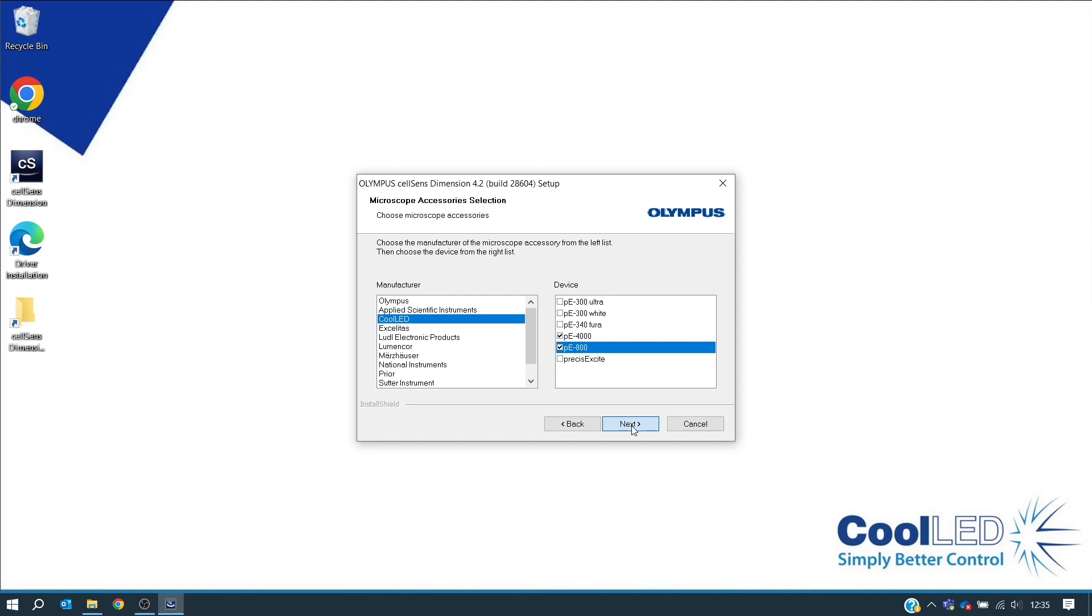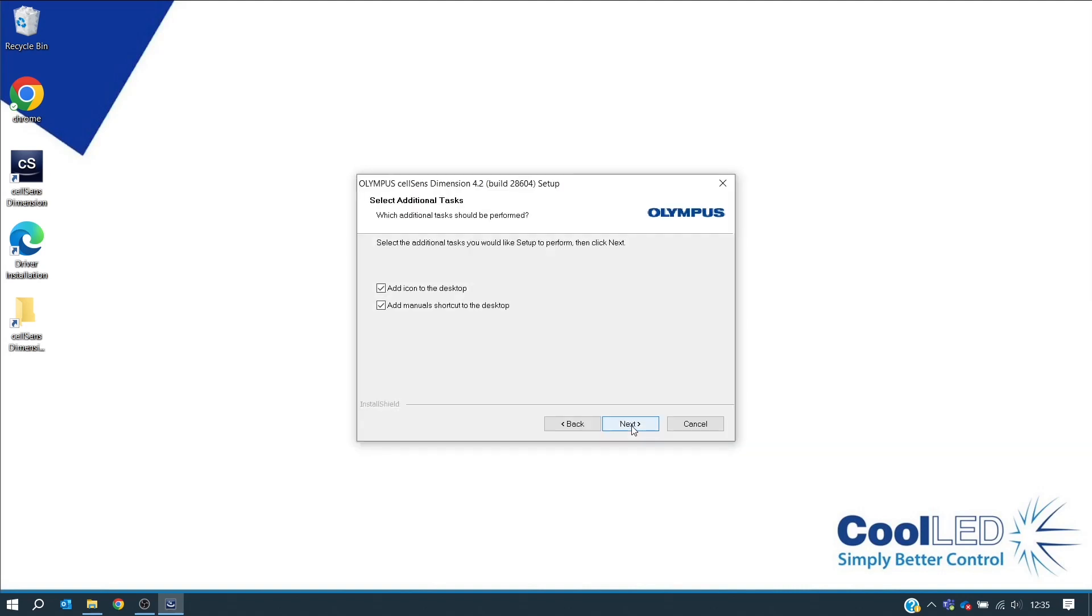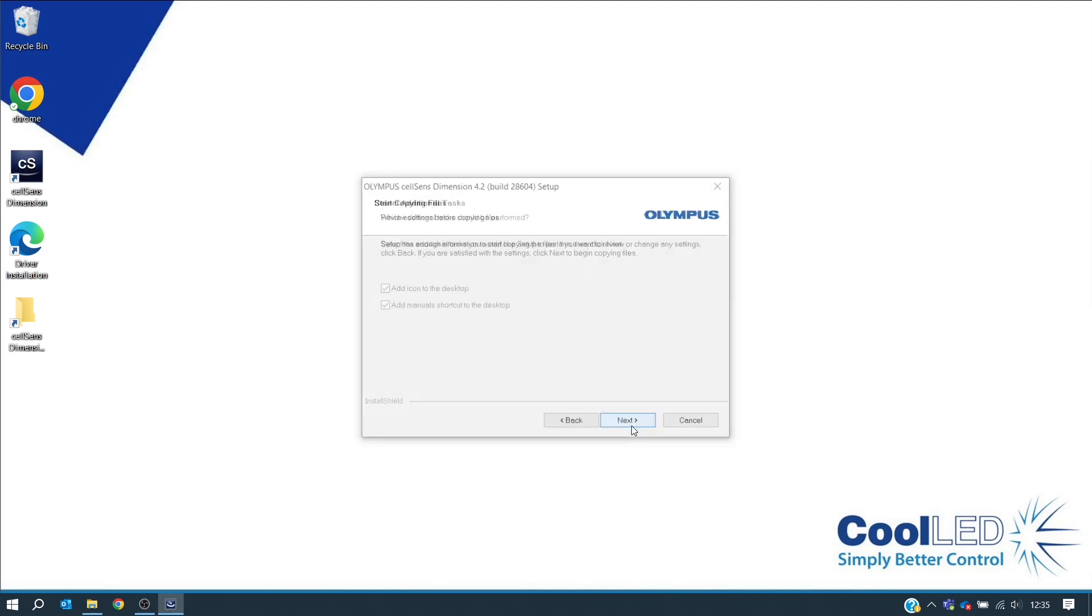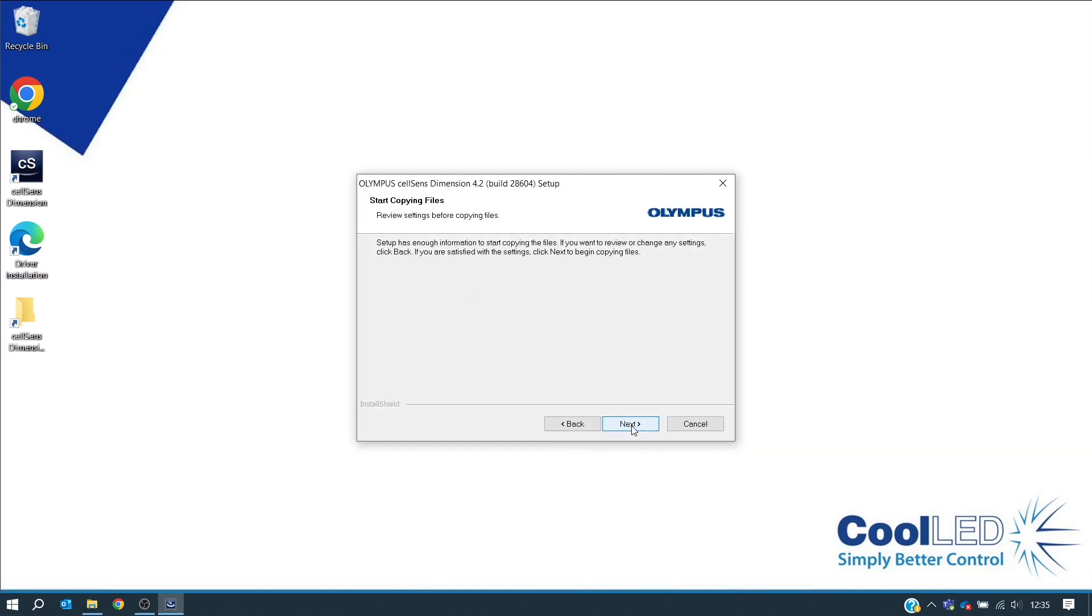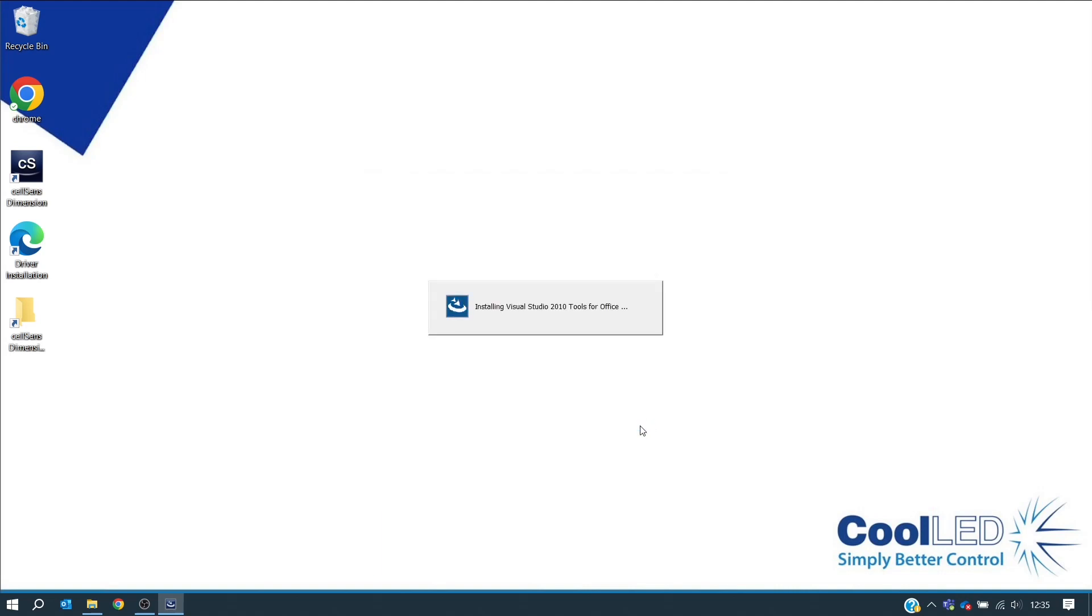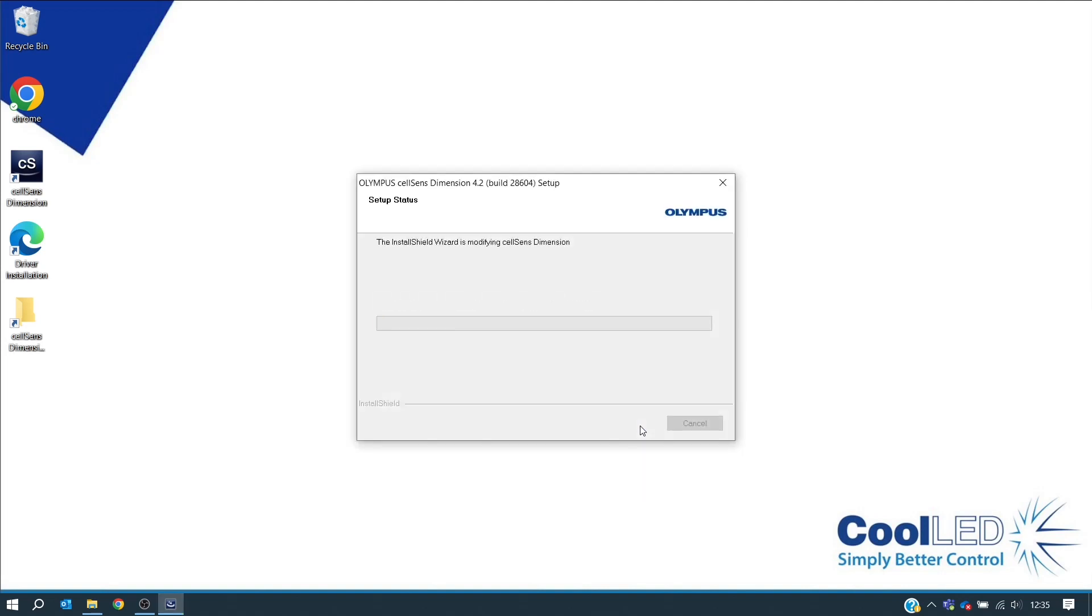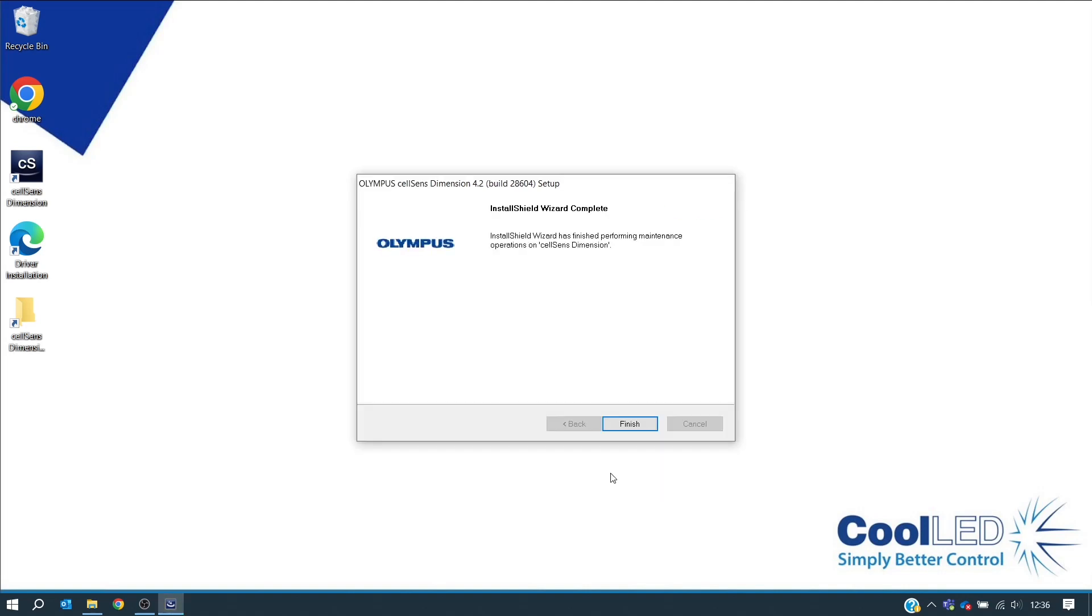Next. And Next again. And now you just wait for the installation. Now click Finish to complete the installation.